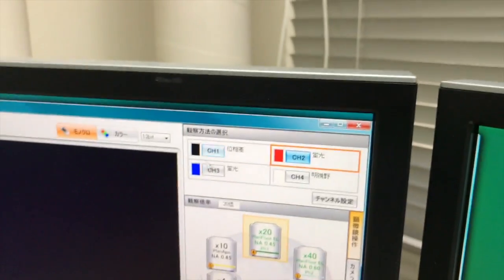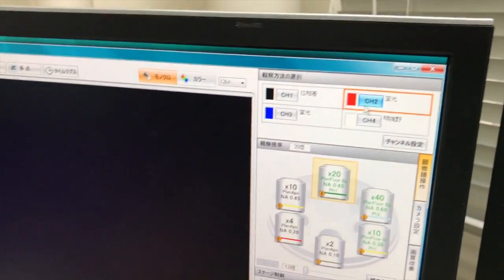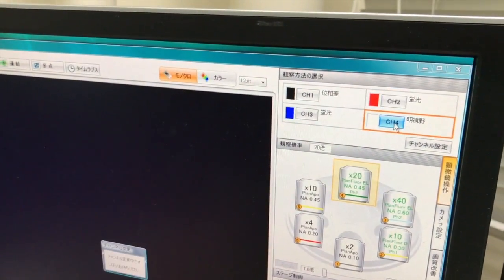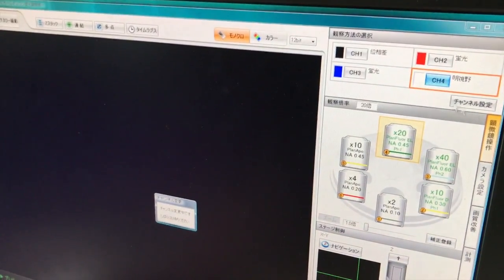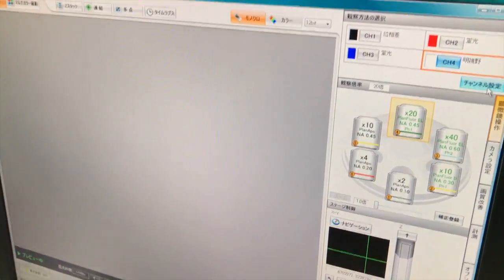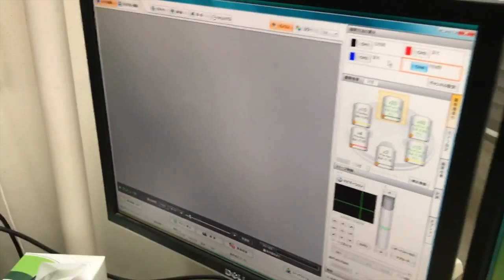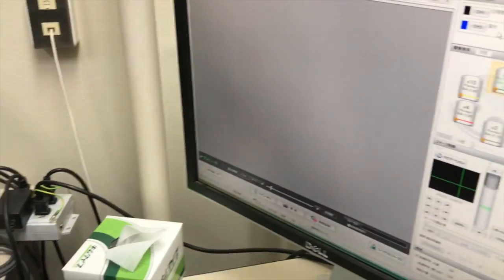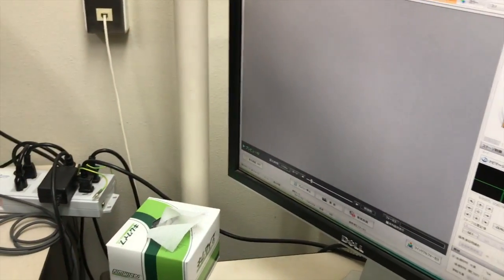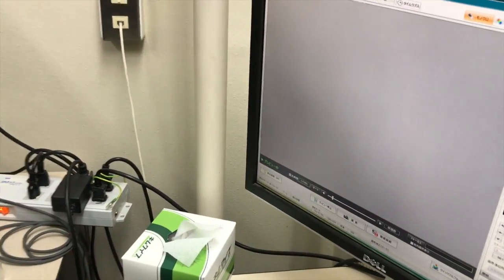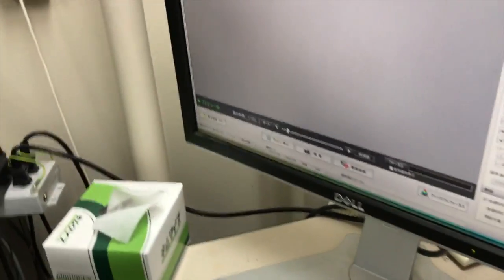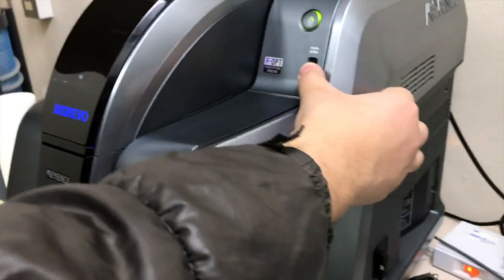And this is for the fluorescence. Channel 4. Channel 4, this one for normal. So no fluorescence is included. So for example, I want to put here. Clear sensor. You open from here.